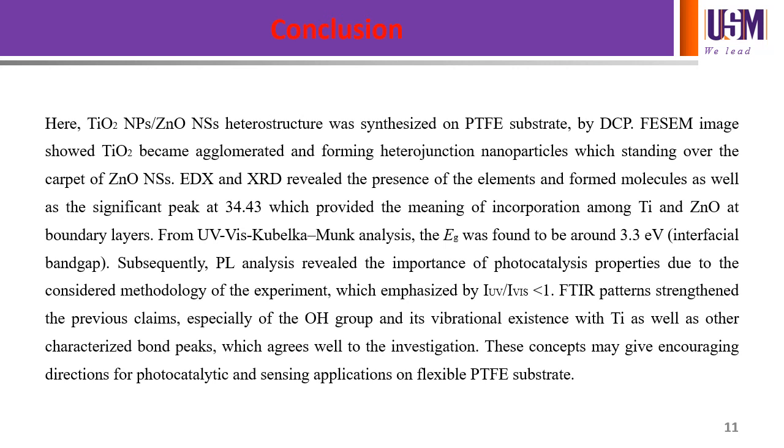The UV visible Kubelka-Munk study revealed that the energy band gap is 3.3 electron volt as interfacial band gap. The significance of the photocatalysis properties was afterward disclosed by photoluminescence analysis as a result of the careful experiment design, which was highlighted by intensity of UV with respect to intensity of visible light less than 1.